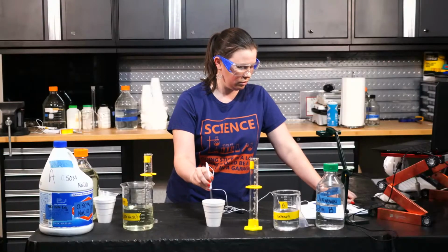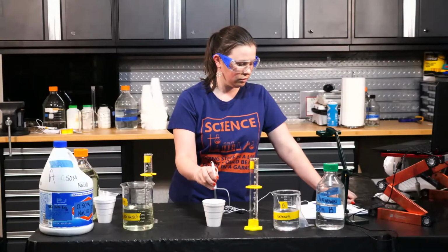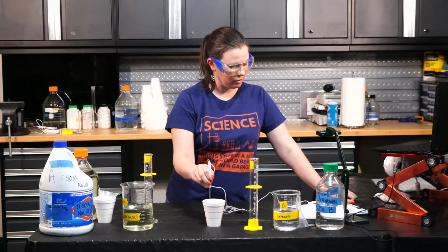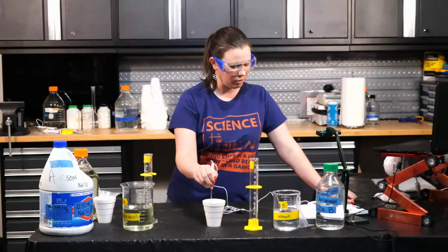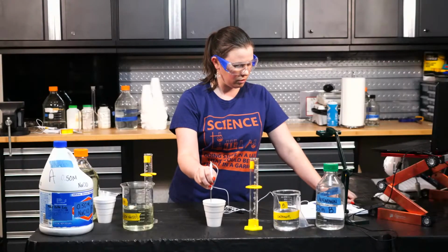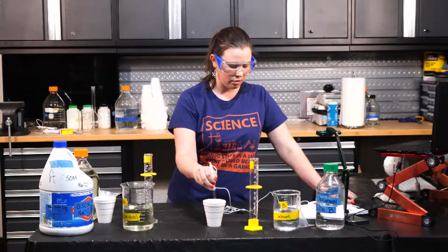35.0, 35.0, and still 35.0. Seeming like we've hit our plateau here. Give it another second, just in case. 35.0 still. So we're going to call it 35.0 degrees Celsius for level 4.